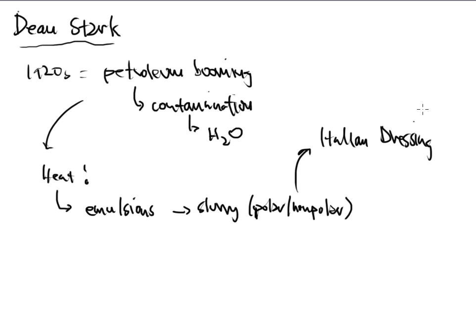Well, in the Italian salad dressing, you're probably going to look really close, and the area where the vinegar meets the oil, the aqueous part meets the non-aqueous part, you'll see a fuzzy, hazy little layer that will look very cloudy. That's what we call an emulsion. And an emulsion also happens in separatory funnels. So let's say that you take the separatory funnel and you put two solutions in and you give it a good shake. Well, if you give it too much of a shake and you agitate it too much, you might mix them a little bit too well. And when you do that, an emulsion or a cloudy layer will form at the interface of the two liquids.